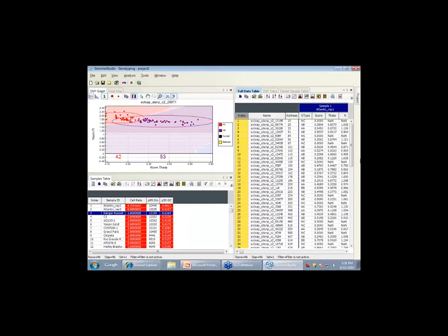So the question is, can you link phenotype data in this software? Generally, this is not QTL analysis software in any way. This is just to manage your SNPs and export genotypes for the most part.